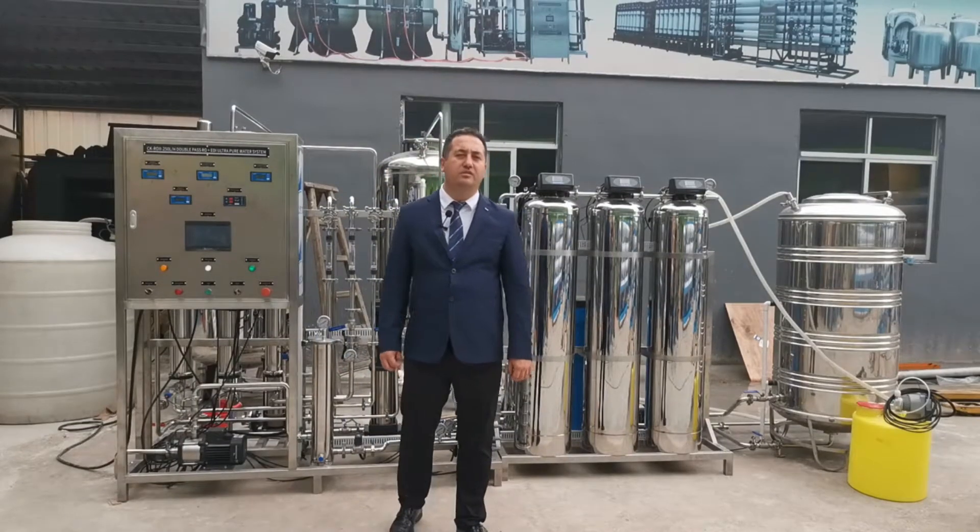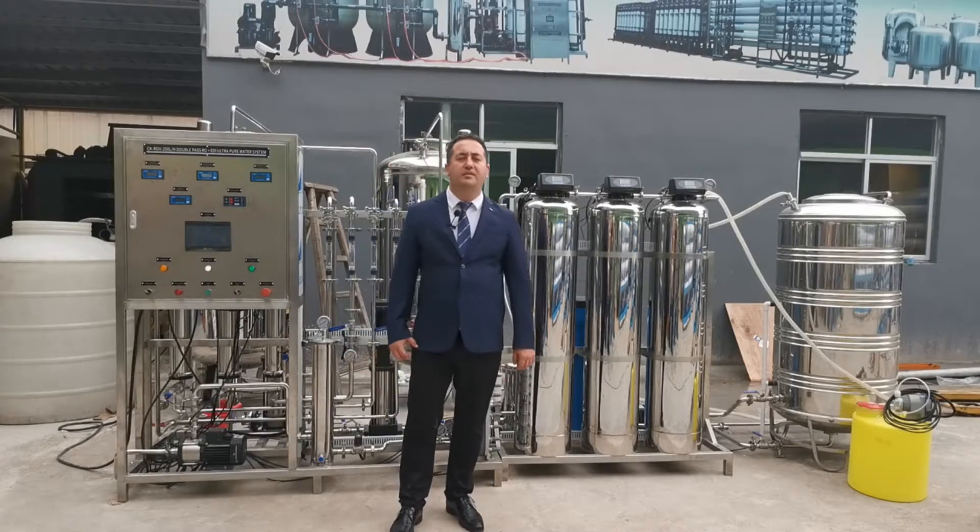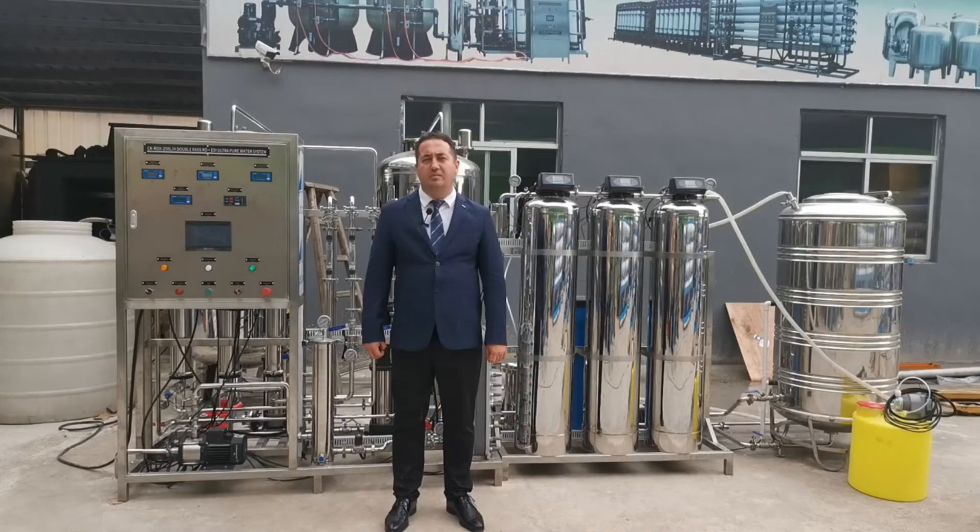Hello, today I will introduce to you a 250 liter per hour double pass reverse osmosis plus EDI system.